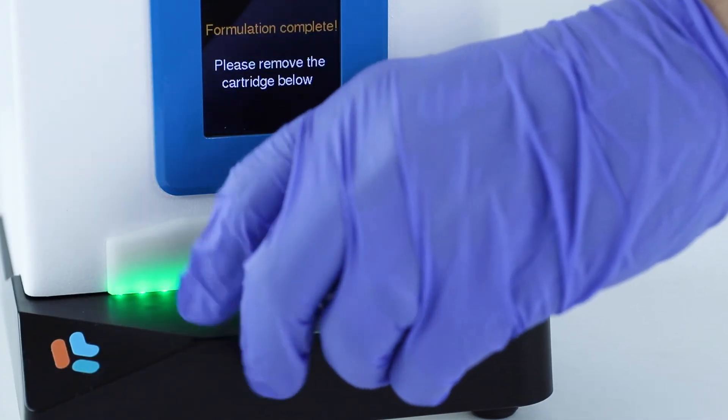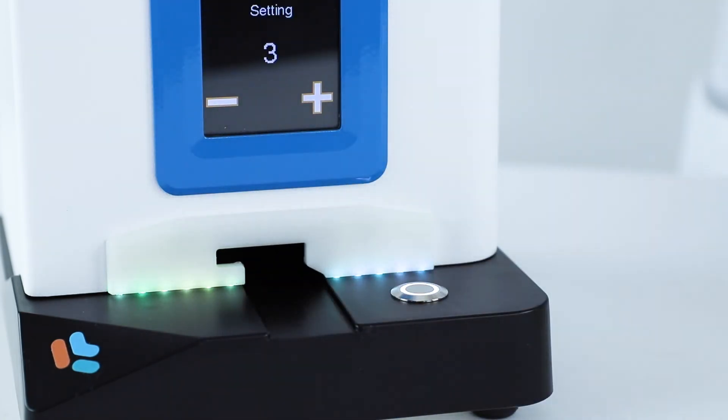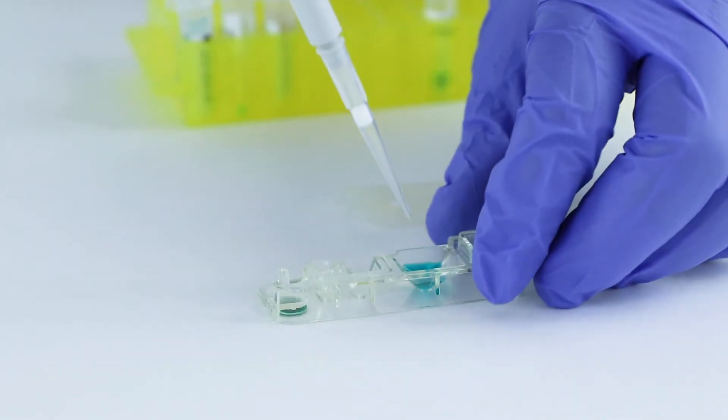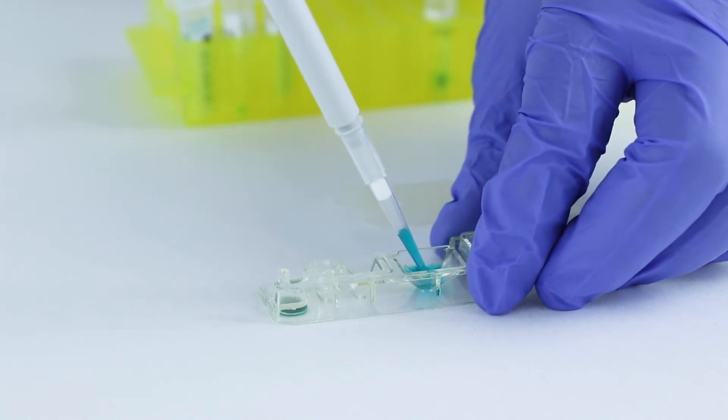Remove the SPARK cartridge and collect your mRNA lipid nanoparticles and dilute them with Formulation Buffer 2.